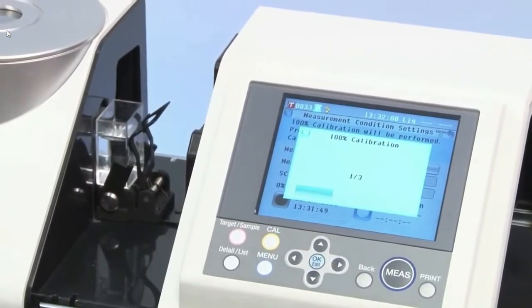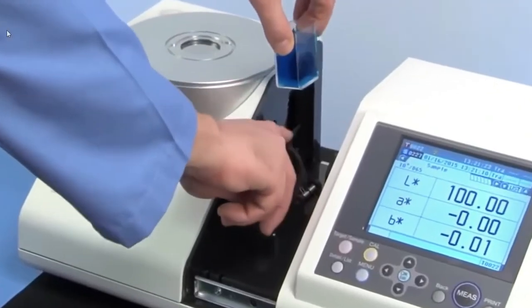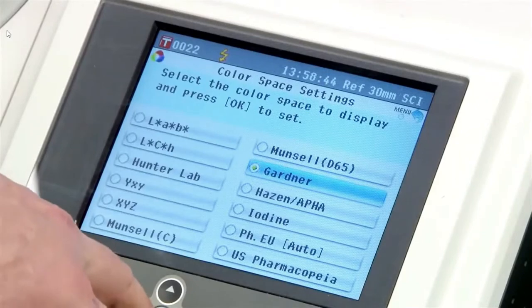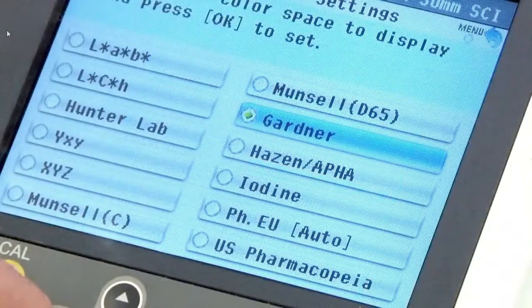In addition to classic colorimetric evaluation systems, the CM5 liquid measurements are evaluated in terms of industry-specific indices.